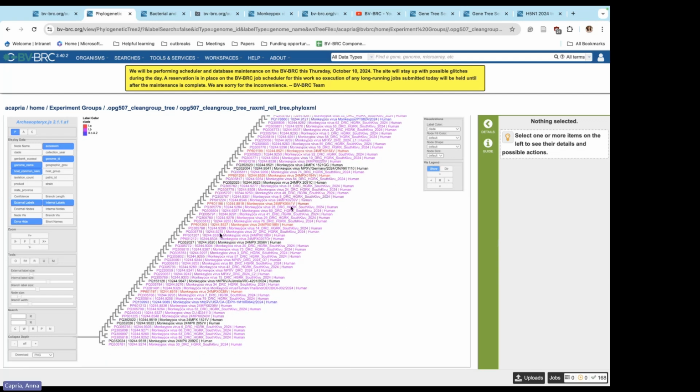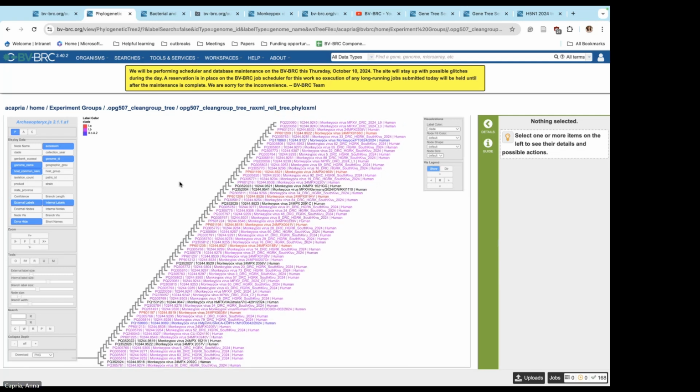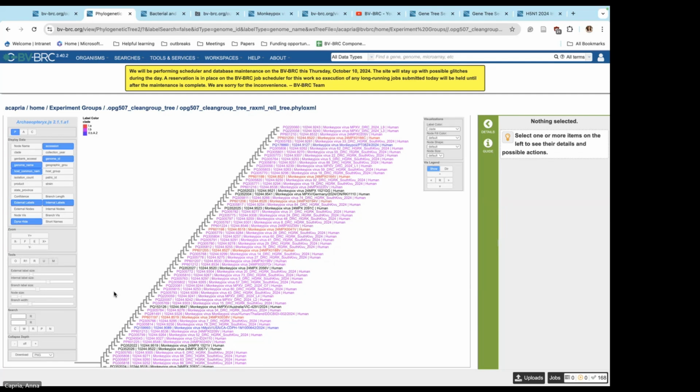And you see, that's a very weird looking tree. I would not even call it a tree. It's because those sequences are identical, so that's why you get this almost stair-step kind of pattern. As I said, in this example, the sequences were chosen to be very similar, or they just happen to be similar, or the same. So that's why it looks like that. But in most cases you will not get something which looks like that. That's just some kind of artifact of branch lengths being 0 or near 0.